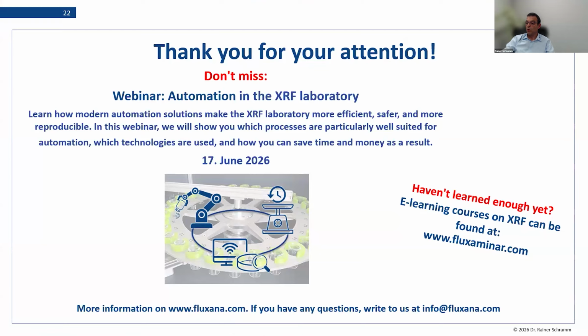There is one coming. What do you mean with the fact that you would like to use sensor technology in future? Yeah, the sensor technology will have a big impact in, for example, maintenance of instruments. That means that you know already in advance when you have to clean your machine, when the furnace starts to break down and the heating is going over. So this can all be done with sensors.